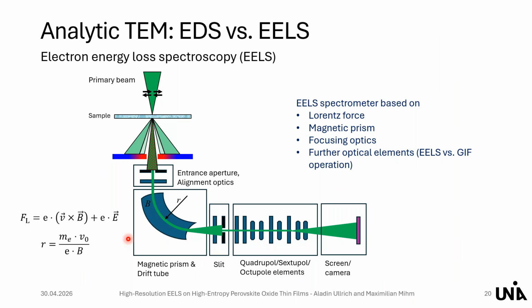In the dual EELS mode, you always record the low loss region, where you have the zero loss peak, and the high loss region, so the region with your elements or with the edges you are interested in, at the same time. And then by a post-processing step, you can correct for the zero point of the energy scale and get high quality data this way.